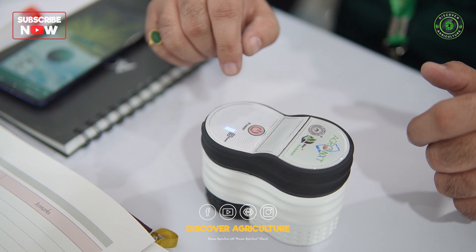We are from Agronix Services Private Limited and we have come out with a device called Agronix Blue Pariksha. This device is an innovation of IIT Kanpur and it is a rapid smart soil testing device. It does the diagnosis of the soil within just 90 seconds, and along with the diagnosis it also comes with tailor-made recommendations for that soil for the particular crop you want to sow.